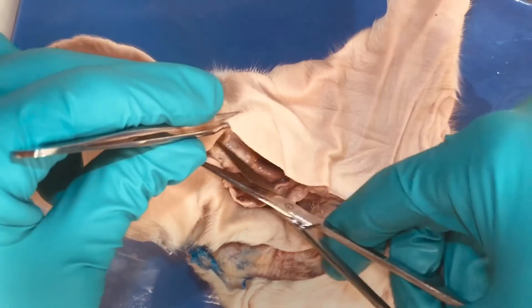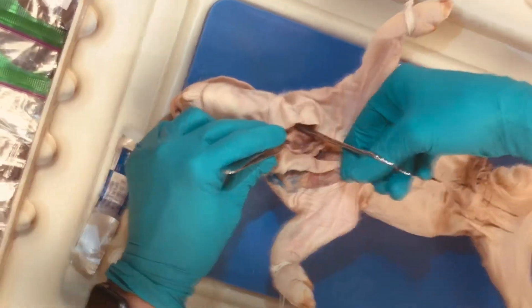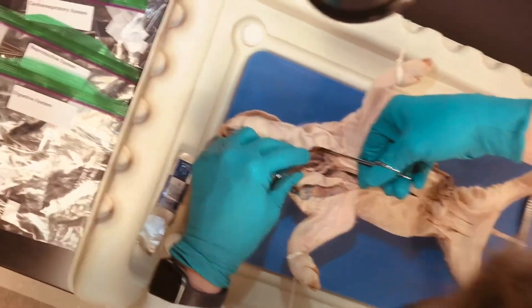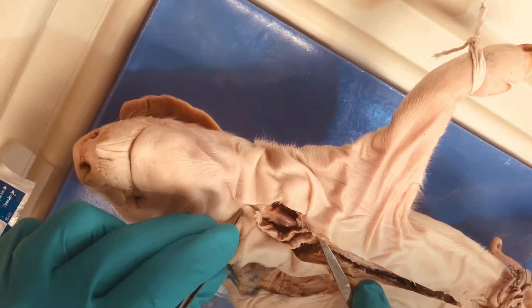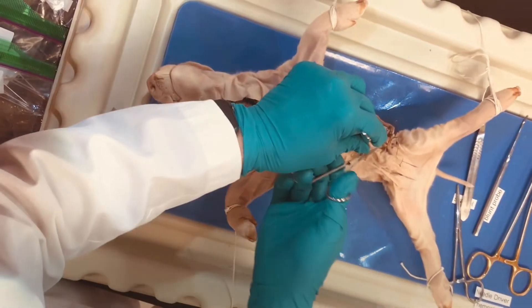For your pigs, you are going to want to extend this incision a little more cranially and also dissect the tissue to the left of the larynx and the trachea. Down in this space, posterior to the trachea, is where you're going to find the esophagus. I'm going to spend some time clearing that out. First I want to extend our incision further back.